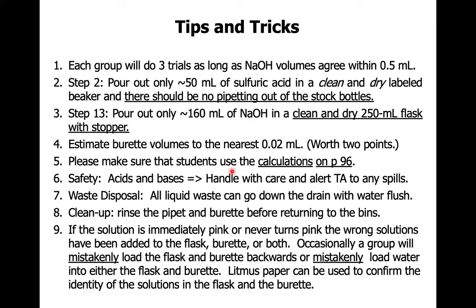Make sure to use the calculations on page 96 when you're doing the calculations. We want to be very safe today. We have acids and bases, so you want to handle them with care, and alert us to any spills. As far as waste disposal, all liquid waste can go down the drain with a water flush. Clean up: rinse the pipette and burette before returning them to the bins.